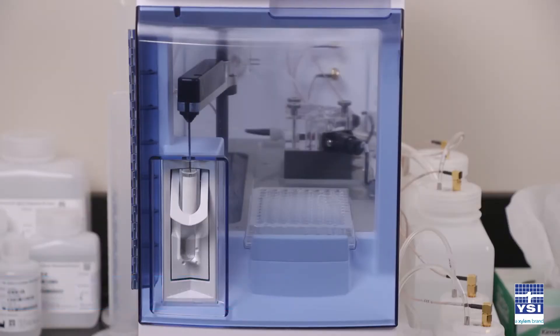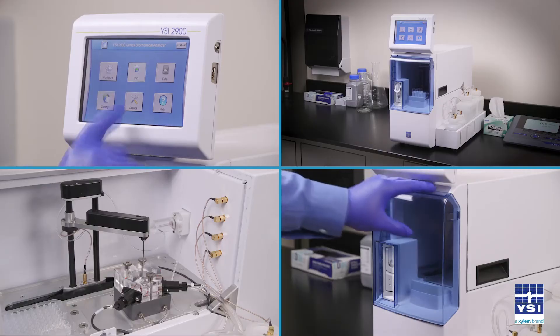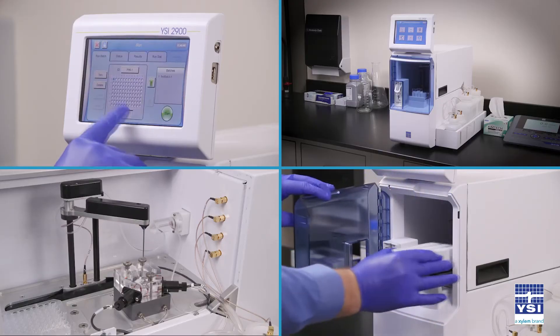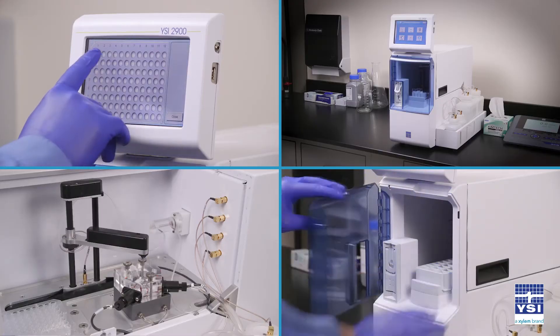Our analyzers are utilized across many industries, including bioprocessing, food and beverage, biofuels, and medical research.